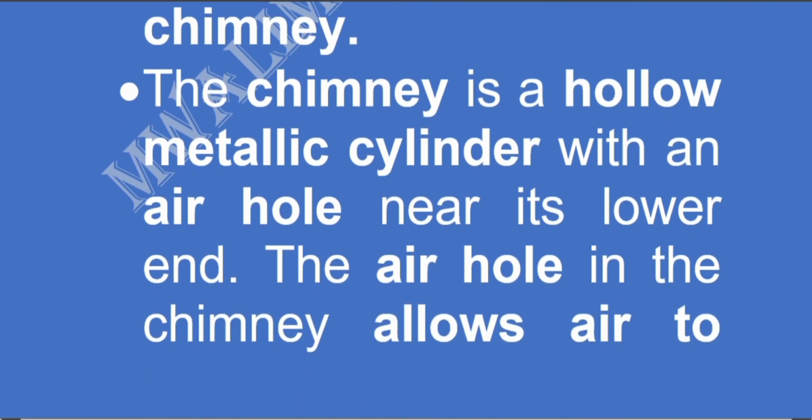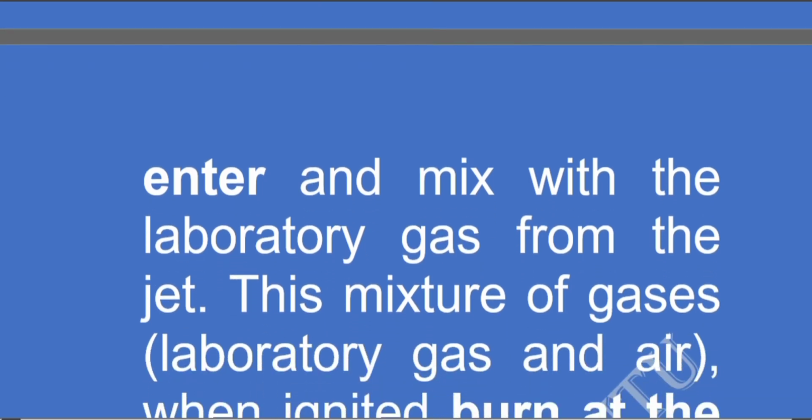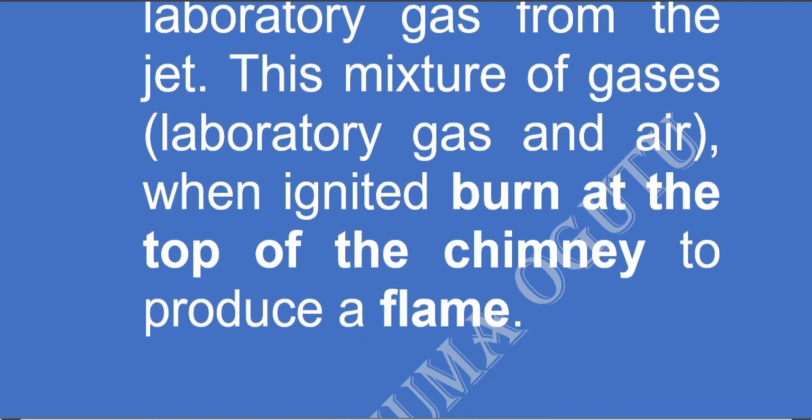The air hole in the chimney allows air to enter and mix with the gas from the jet. This mixture of gases, the laboratory gas and the air, when ignited, burn at the top of the chimney to produce a flame.